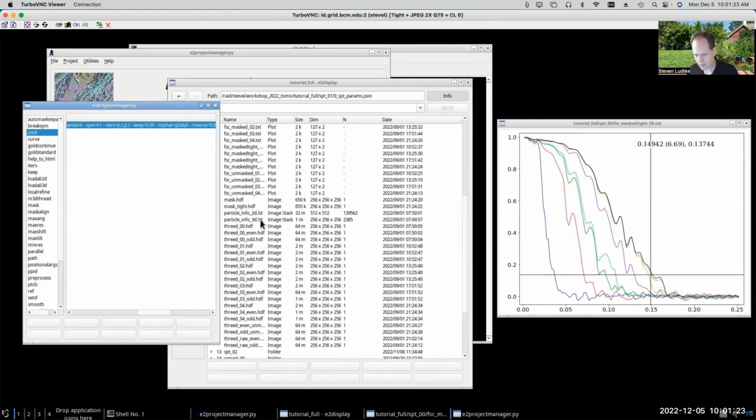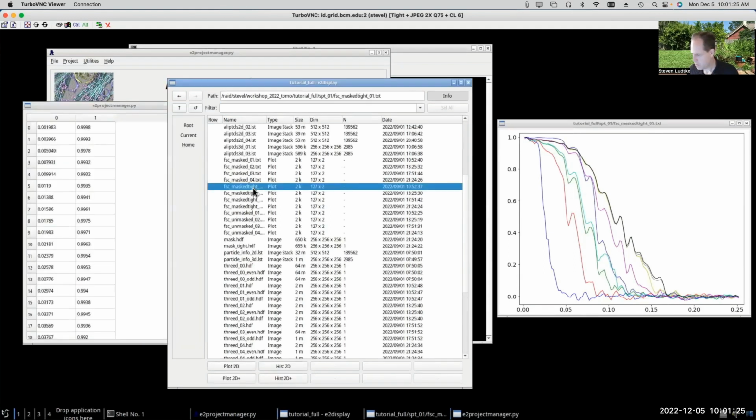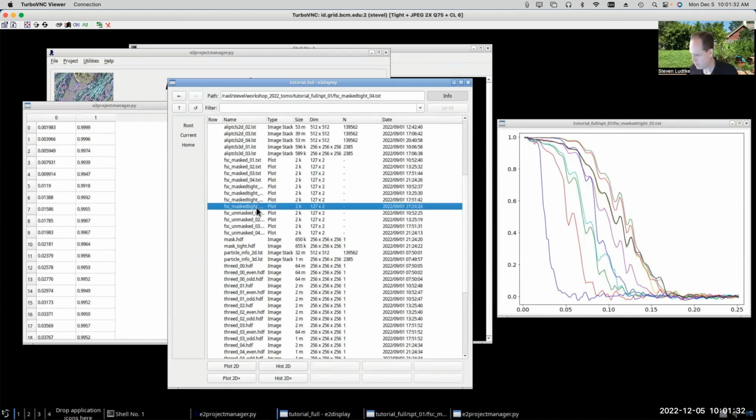And we can see there, 1st round, 2nd round, 3rd round, 4th round. Now, this did get a little bit higher in here. So ostensibly, the structures might look a little bit better. But if we look at sort of the limiting resolution down here, it's about the same.